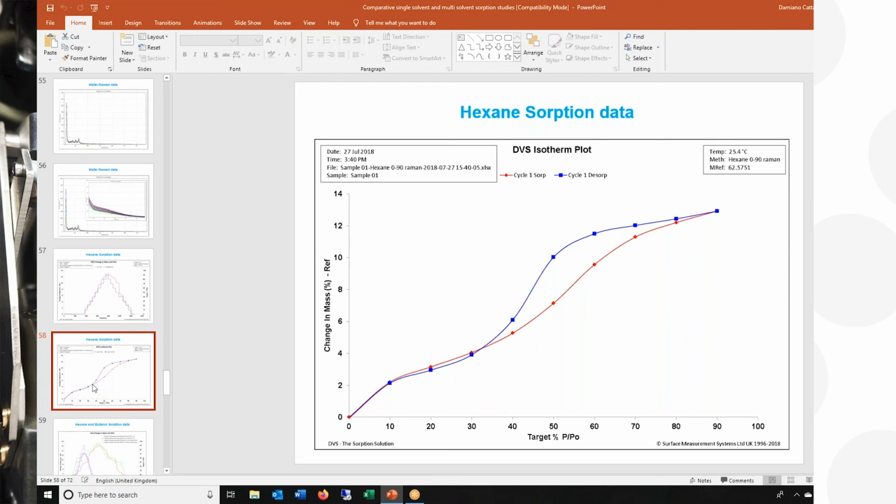So the desorption property of the sample has changed during the experiment itself, and consequently the material does not have a lot of molecules on the surface when you go back during the desorption stages. Most of the transition stages happen during the absorption cycle, and then you see the effect during the desorption cycle. This sample specifically does not have that phenomenon. So these stages are more of an equilibrium condition rather than an actual physical change in the structure of the sample.